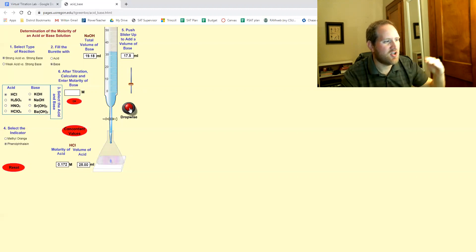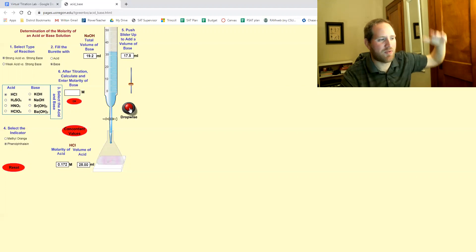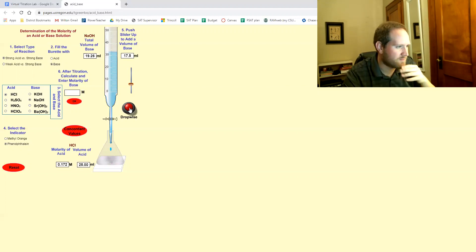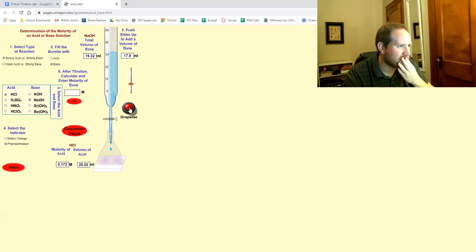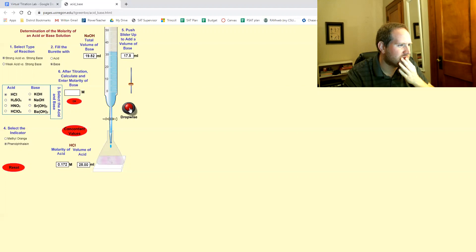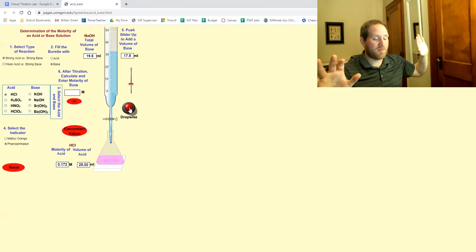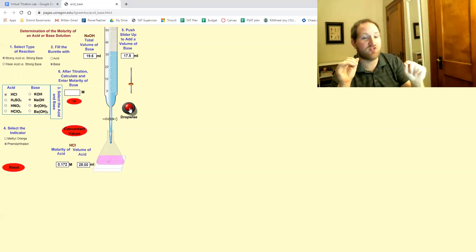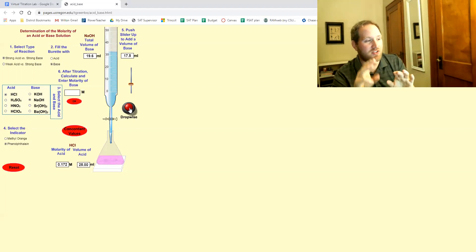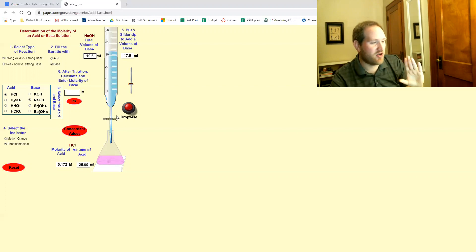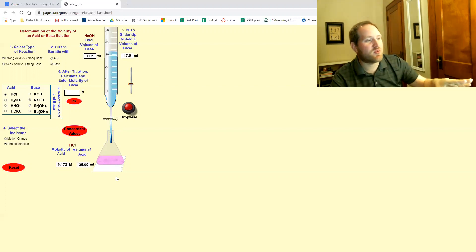And sometimes this takes longer than other times. It kind of depends on where you happened to move it initially. Nope. See that it stayed pink. And I actually, I did an extra drop, but you're allowed that three drop window. So here's where you stop.